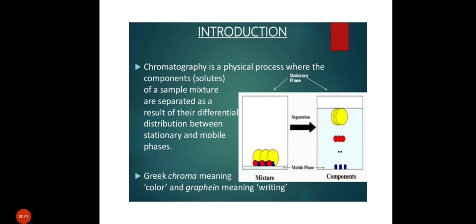It means to write. Chromatography is the collective term for a set of laboratory techniques for the separation of mixtures. The mixture is dissolved in a fluid called the mobile phase, which carries it through a structure holding another material called the stationary phase.